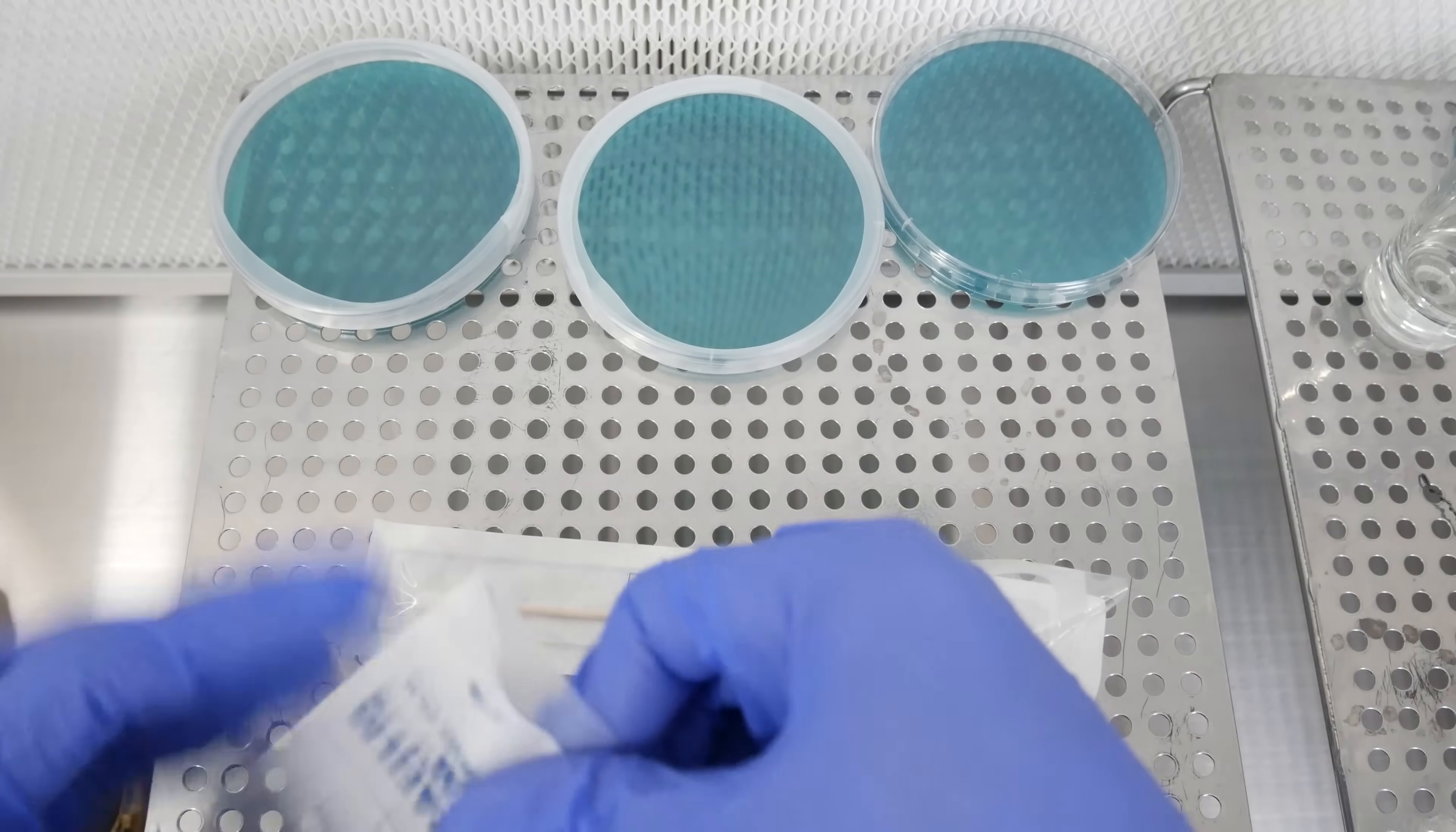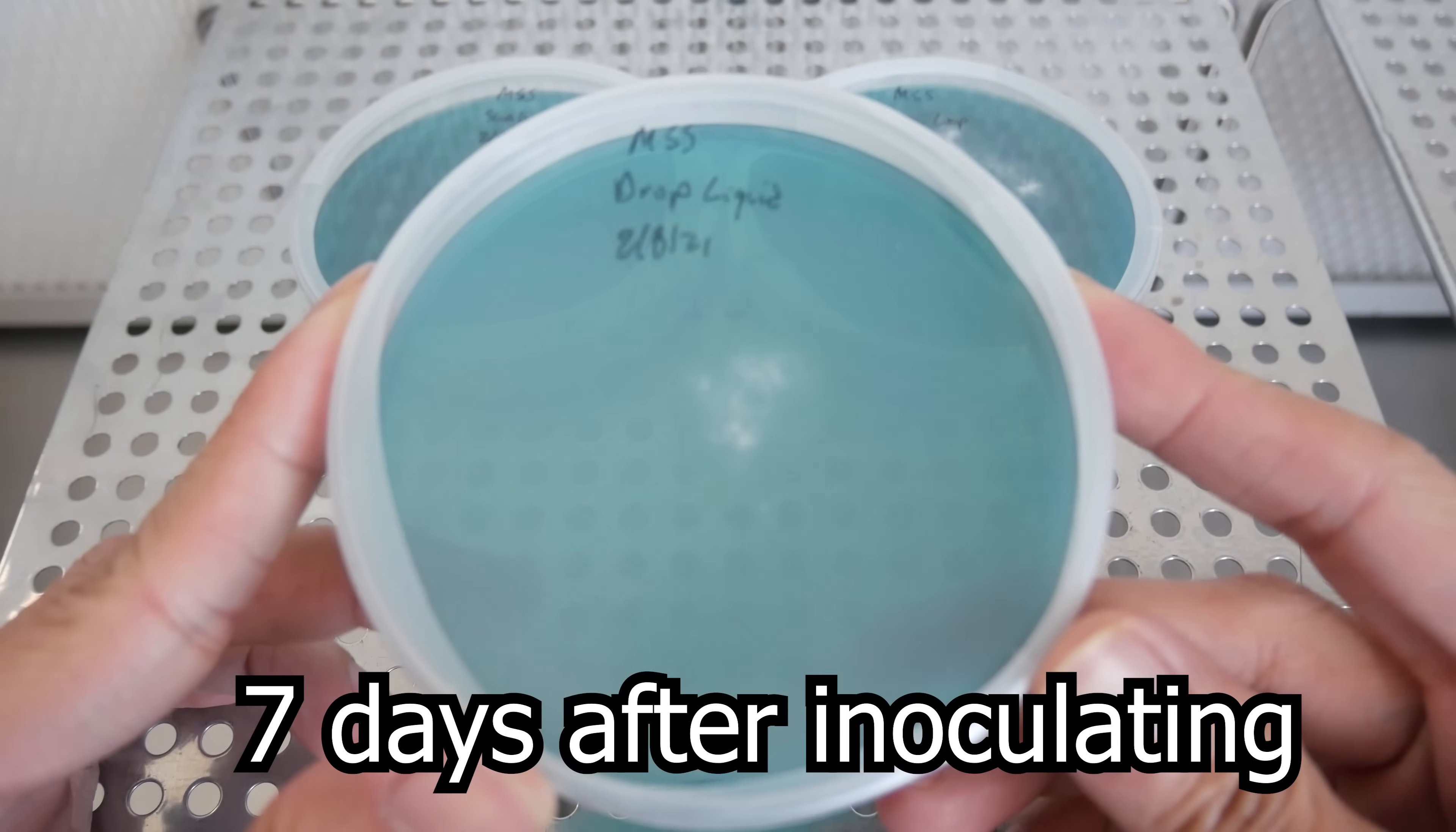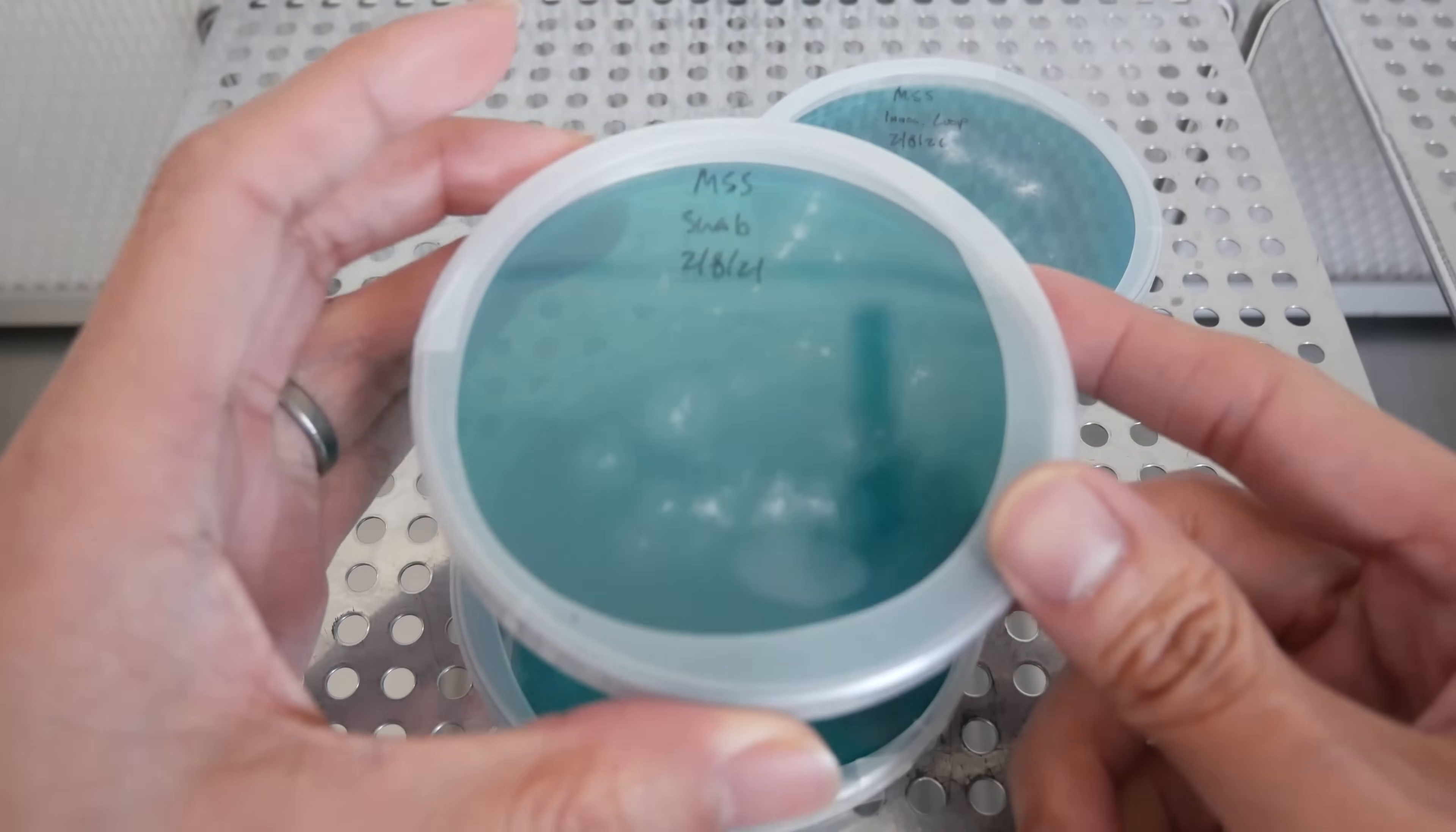Here we are one week later, and this is what your plates may end up looking like if you have successful germination. Here's the plate that has the two drops of spore solution directly in the middle here. When you start seeing that white fuzz appear, that means your spores have successfully germinated. Congratulations, you are now a proud parent of mycelium culture.